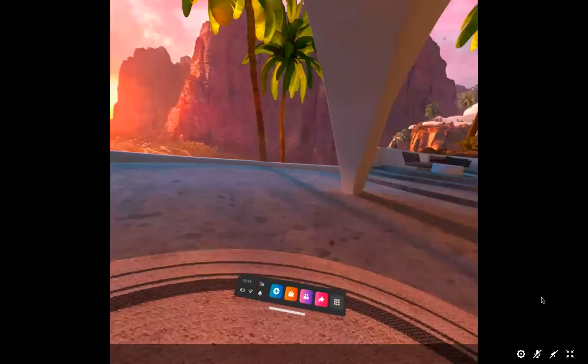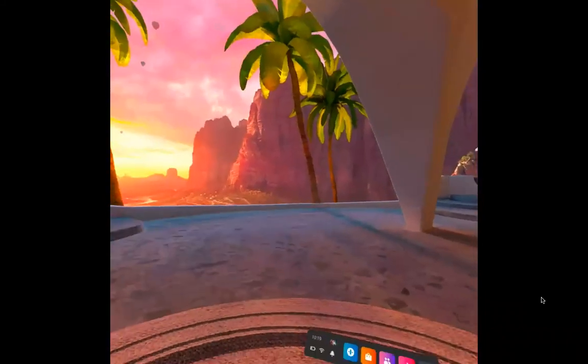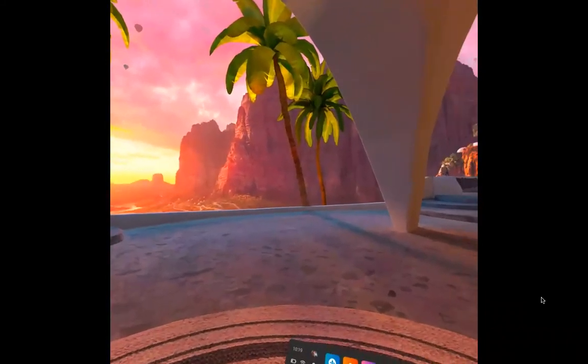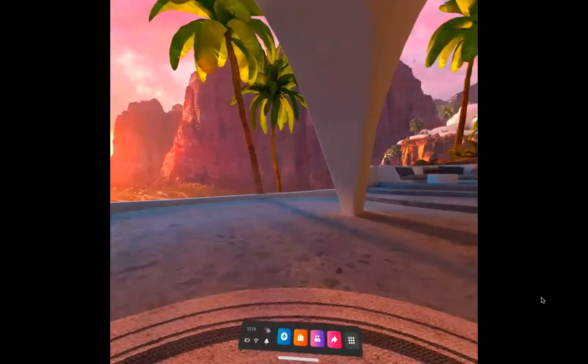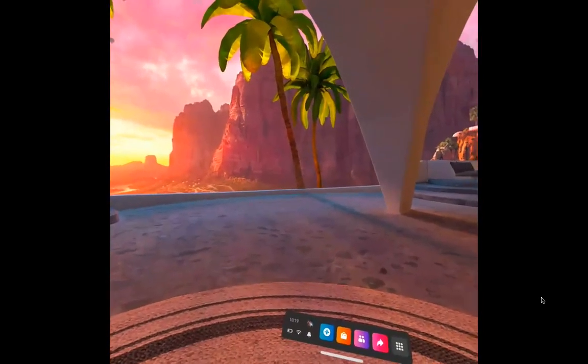Hi, my name is Jia Wan. Today I'm going to show you how to have VR and AR views in iCN3D.